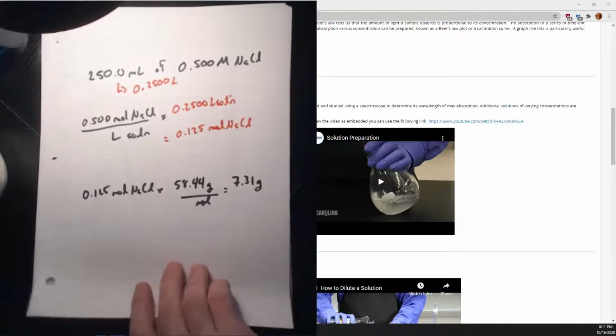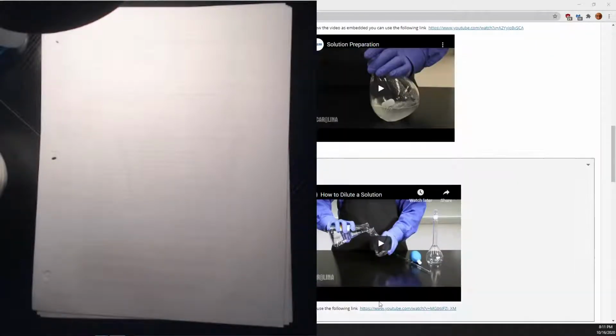Now, the glassware we use for this, you can see it in the background here, over on the right. That's known as a volumetric flask. Okay. You can see it even more clearly right here. Okay, a volumetric flask is a really, really great piece of glassware in that it can only measure one volume of liquid. And then it can't even deliver that volume accurately. They are typically used for making stock solutions, for making something with a very precise volume. The shape is really well suited to making solutions because you can swirl the stuff around in the bottom and it won't climb out the sides and come out the top.